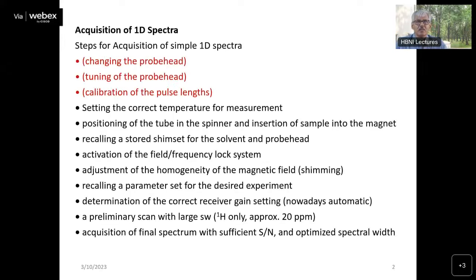So yesterday I told you about various parameters to be set to get a 1D spectrum, or for recording a spectrum in an NMR machine. So these things are summarized here.